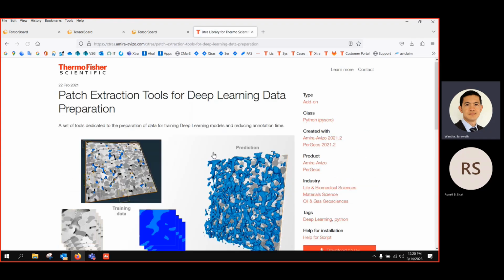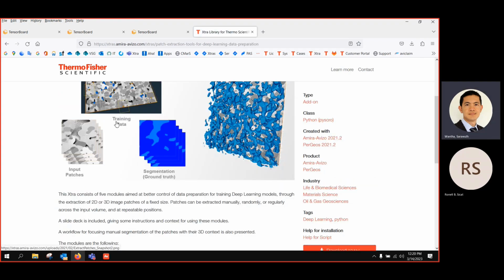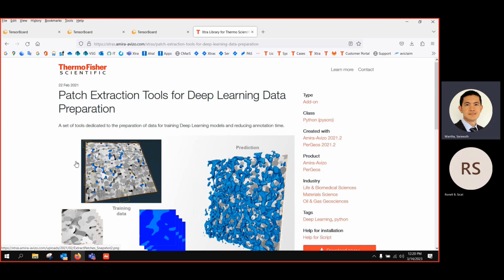So for example, you look at here and they generate the patch. And even here they look at the pullback artifact. No, this one is not what you're asking, but it's more like the previous tutorial I showed yesterday, where you create patches in different regions and then segment each patch on the pullback. So you don't have to segment the whole image. You just segment some regions using this patch. So now we have automated the segmentation workflow already.